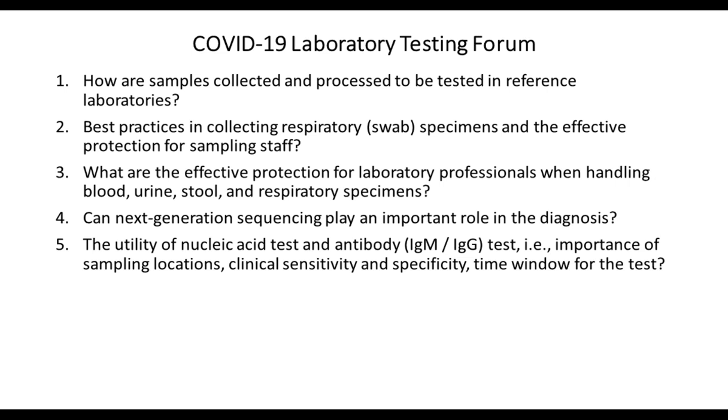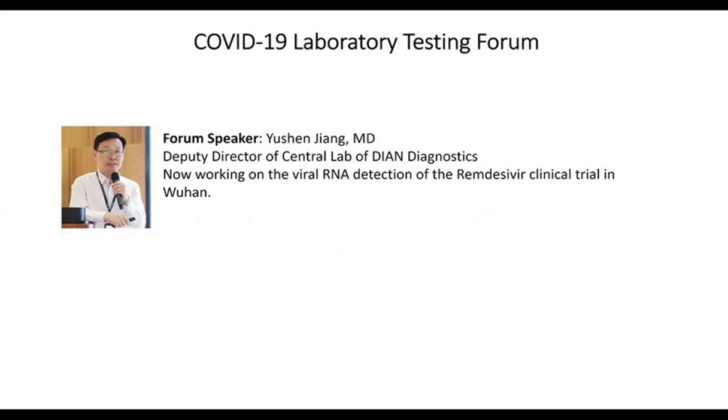Among all the sample types, the sputum sample is most dangerous because it has the highest positive rate, the highest virus load, and requires much more complete processing steps. We tried different kinds of pre-treatment. Although sodium hydroxide is a little better than proteinase K, the viral load tested after pre-treatment with sodium hydroxide is only a little better, but the operation of proteinase K is much simpler, and here we choose to use proteinase K to pre-treat the sputum samples. Here we use 55 degrees centigrade for 30 minutes with proteinase K to liquefy the sputum samples. So that's the things that I can share about this question.